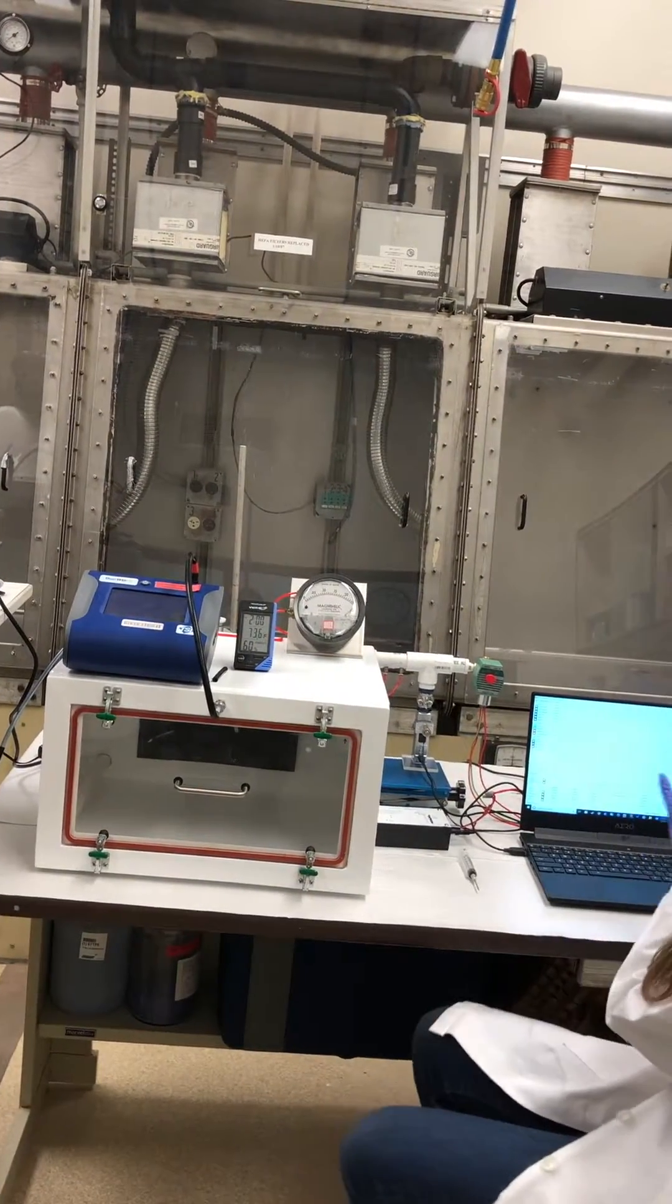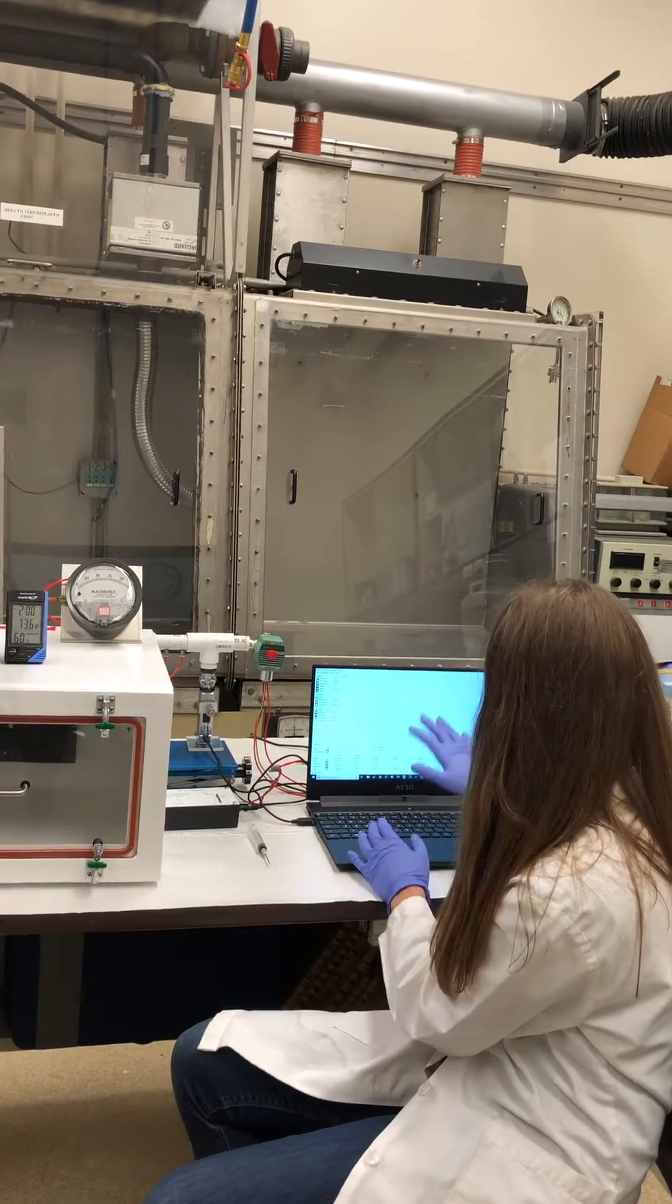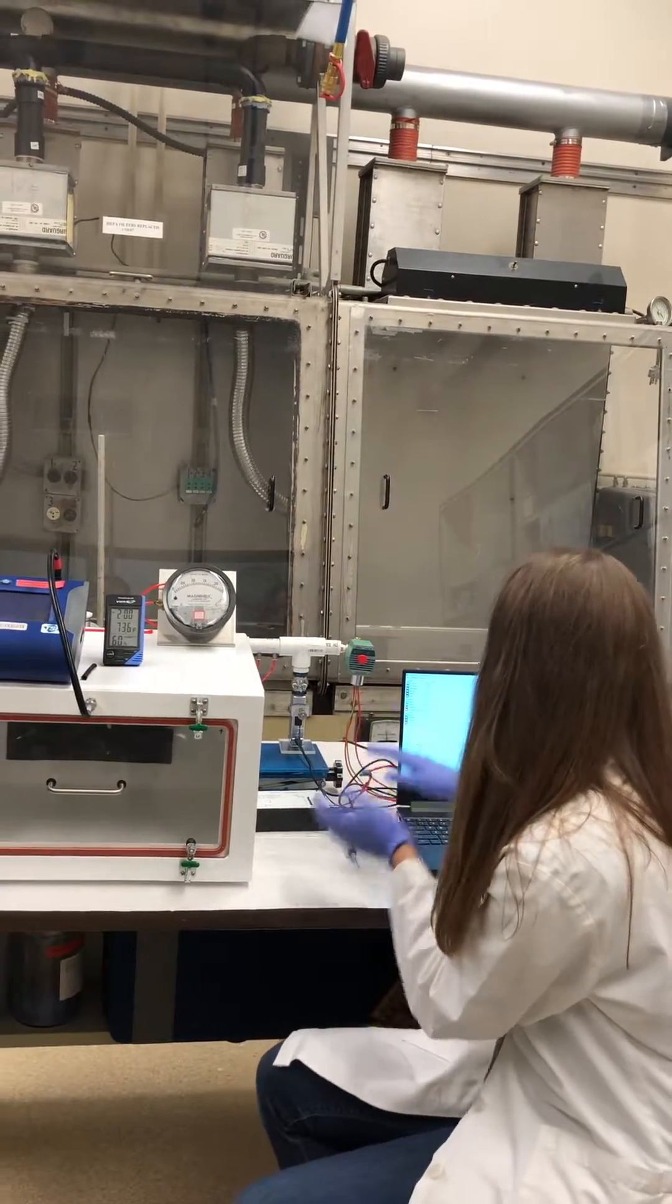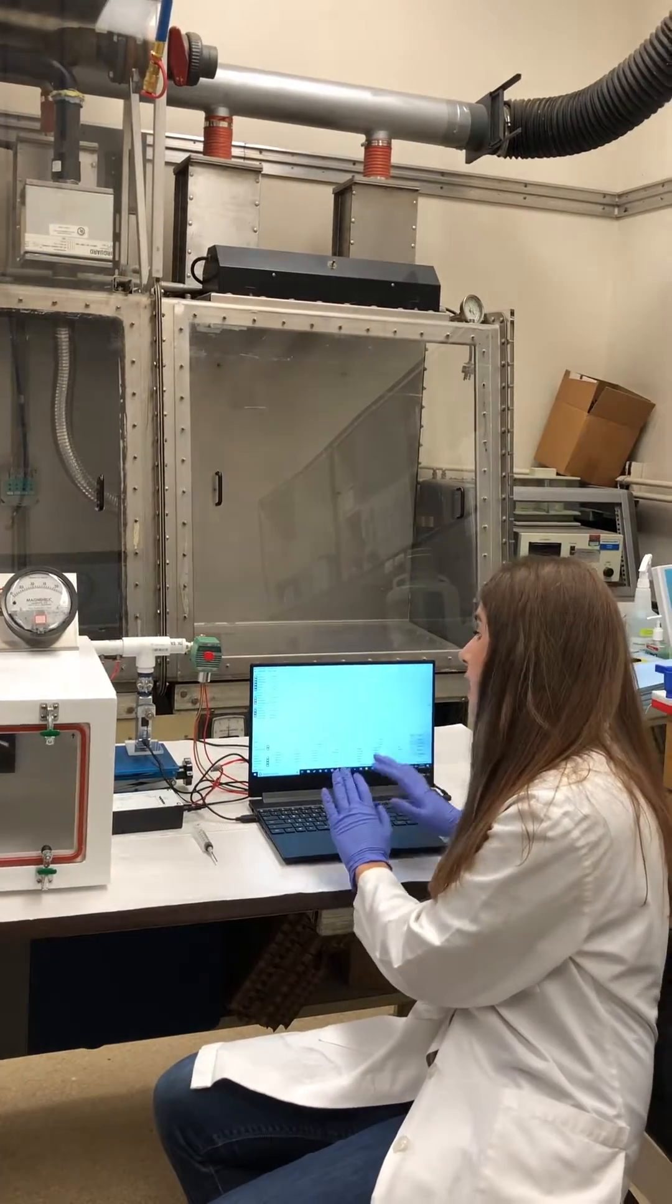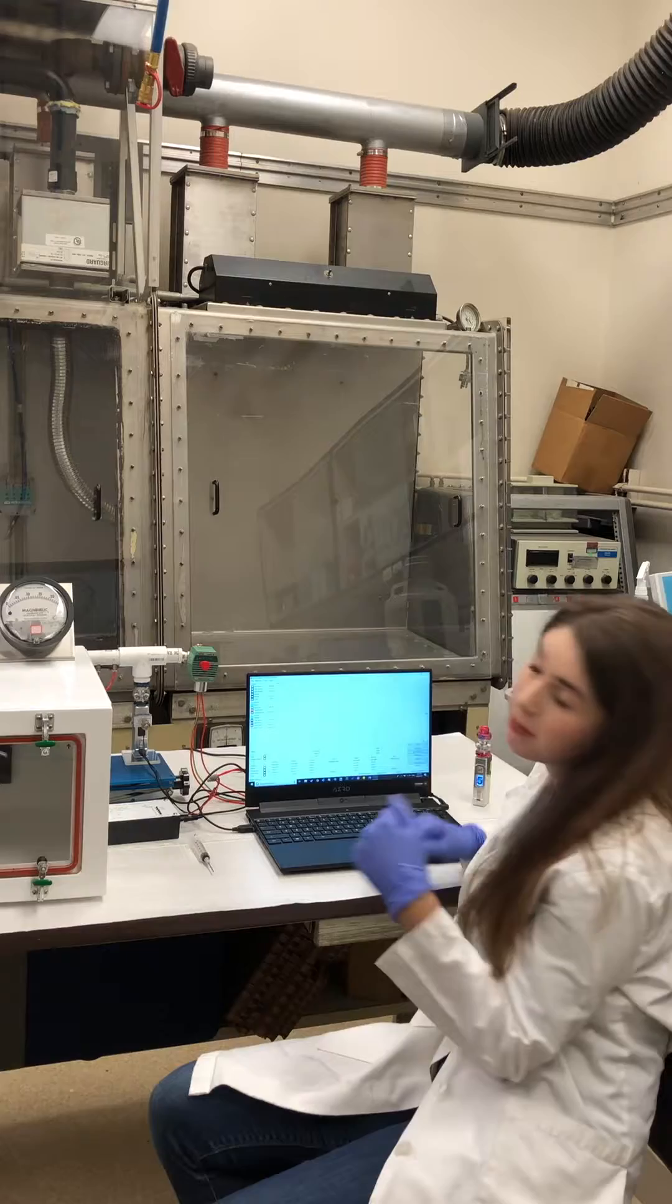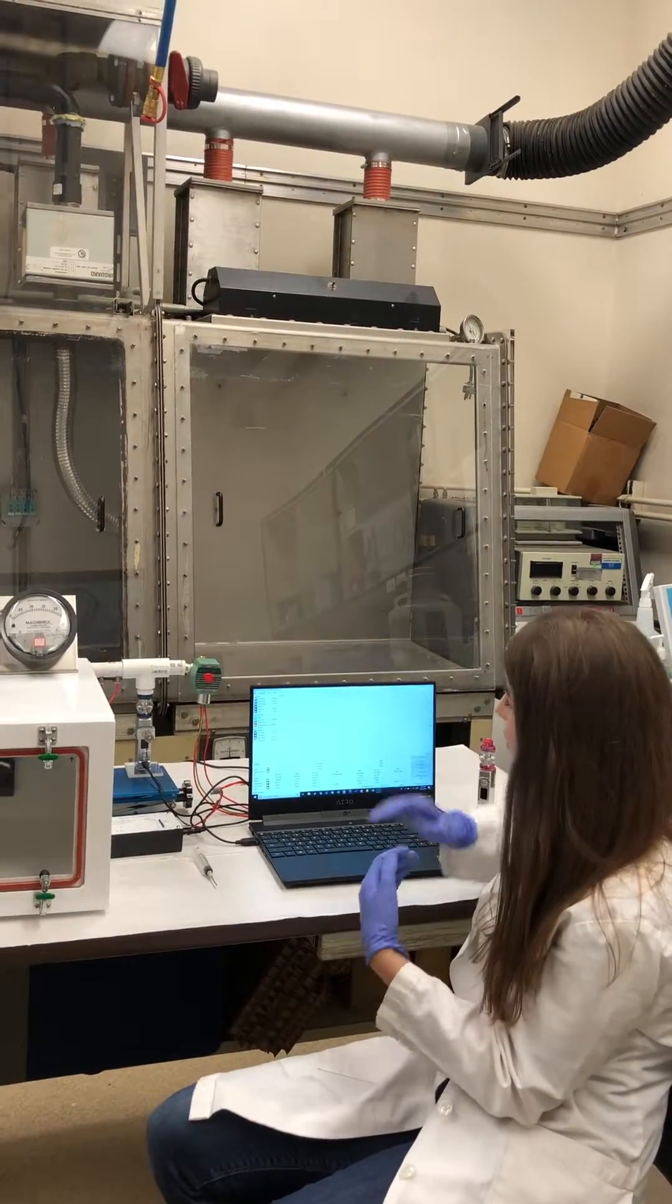And so we use the controller, the computer, in order to control the puffs. We can actually set the temperature at which the device operates. We can set the amount of power that the device gives in order to achieve the temperature that we want.